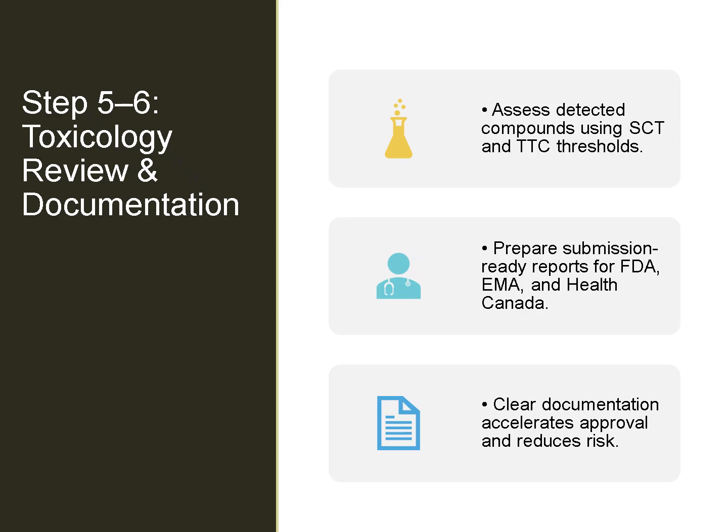Now comes the most important part, interpretation. All those detected substances are evaluated through toxicological risk assessments, comparing exposure levels against safety thresholds like the Safety Concern Threshold, SCT, and the Threshold of Toxicological Concern, TTC. This helps determine if any detected compounds pose a health risk, from carcinogenic potential to genetic or systemic toxicity.